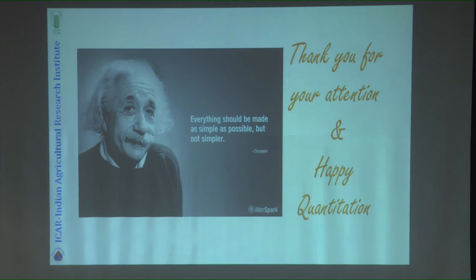Well, I just end with this particular slide. Again, everything should be made as simple as possible, but not simpler. Quantification is also on the same principle. We know how to quantify, but it cannot be so simple that you can easily quantify. Right at the moment we are using qPCR for DNA. Well, we will come out with more refinements and improvements to quantify the number of genes in your sample.